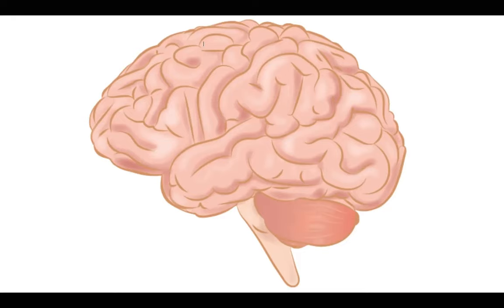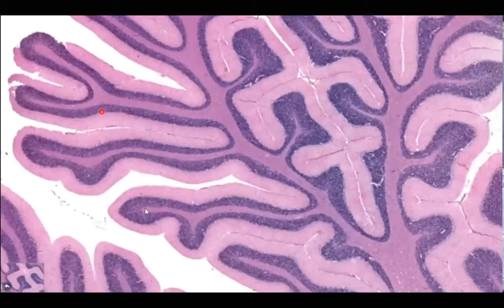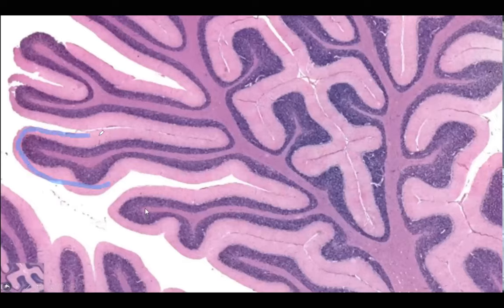Here we see our first histology slide. Notice we have raised ridges — each raised ridge is a folium — and then the invagination is the sulcus. So we have these raised ridges (the folia), going down into the sulcus, then another folium and another sulcus, and so on.